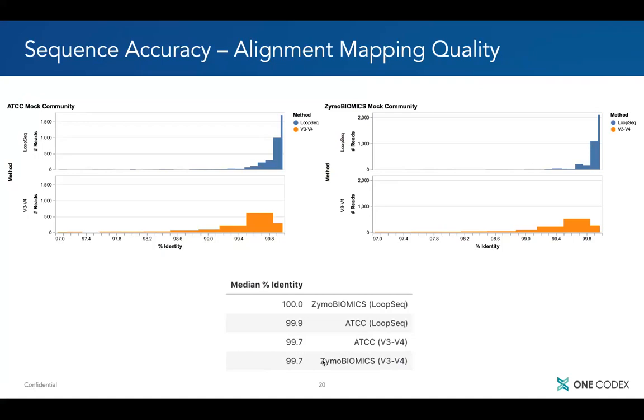And so you might make a species miscall on the basis of that 0.3% error rate. You might simply have a base mismatch that means you can't map to the reference with the same confidence, et cetera. So that decreases the specificity of the results, and it's also a source of a lot of the mismapping problems for 16S.